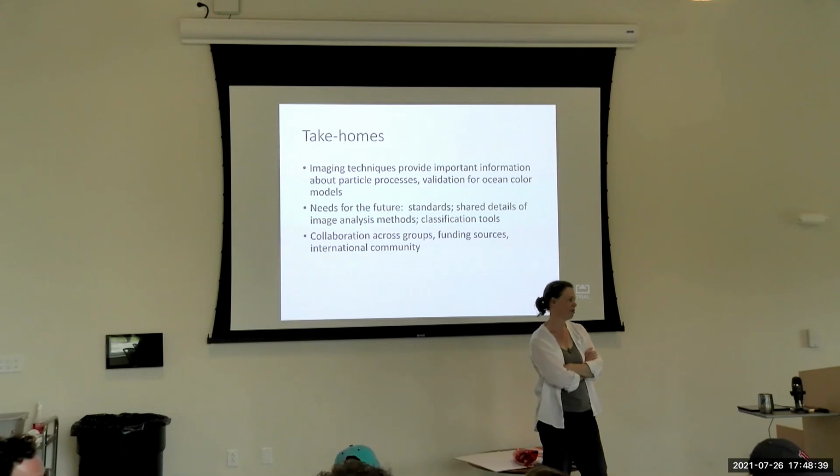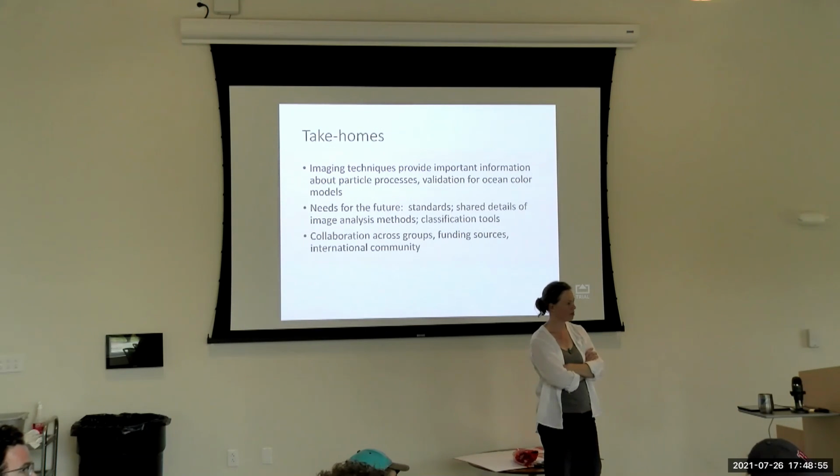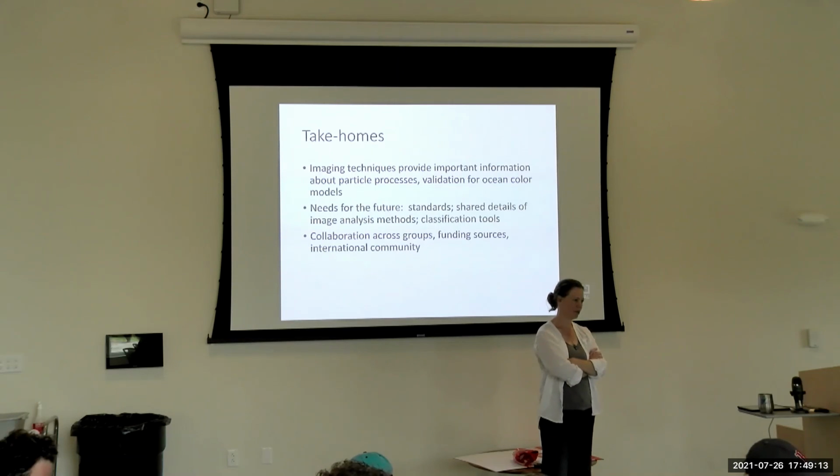So where do the images sit, how do you get to them, how do they get classified, and what version of what program was used to classify them, sort of finding the provenance of those images. It comes down to providing every image with some URL. So every image that you cut out has its own URL, and it's linked to a metadata file, which says where that sample was collected, what the settings of, say, the IFCB were when it was collected, and what version of the classification program identified this as a diatom, and which classification scheme was used.